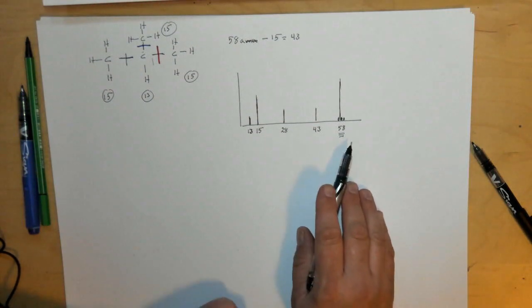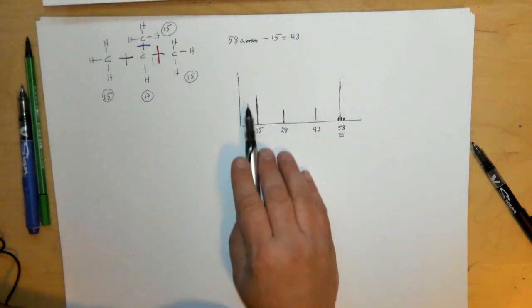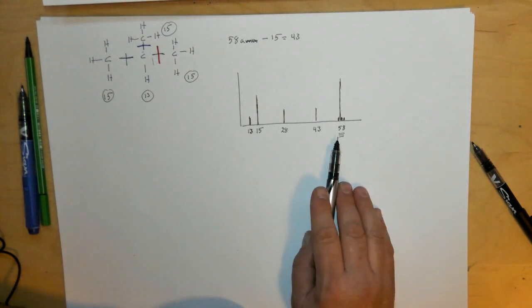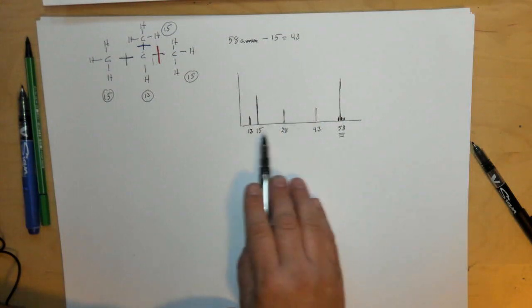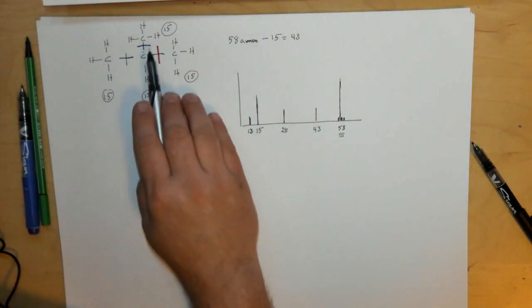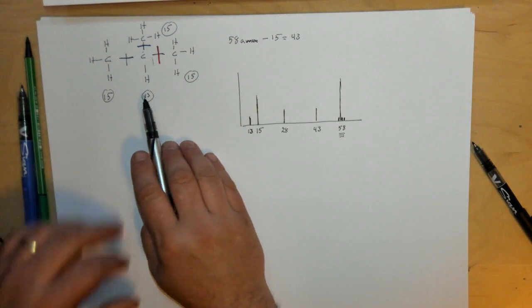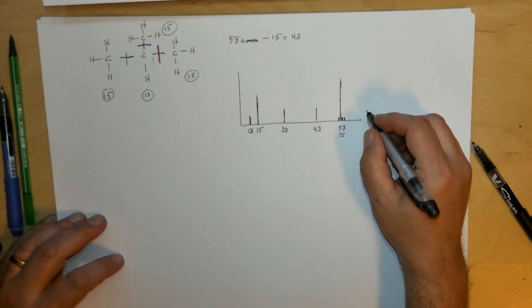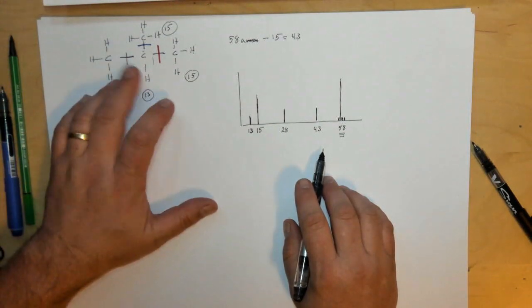So a mass spec diagram for this particular molecule, depending on how strong the ionization is, will look something like this. You'll get a peak at 58 for the mass of the whole molecule, and then varying degrees of breakage depending on which bond has broken. And then you could probably put this molecule together, if you had practice and became skilled at looking at this kind of diagram.